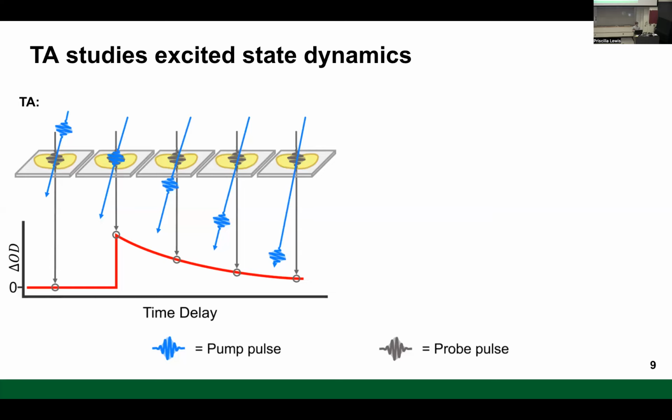Now at the second time point, we see the pump and the probe overlap one another. This means we are probing the excited state population right as the pump is exciting it. So of course, we get the largest excited state population. We call this time point time 0. Now, as the time delay between the pump pulse and the probe pulse increases, we observe this transient decay in the excited state population. Traditional transient absorption spectroscopy is really great for a variety of reasons. But unfortunately, achieving good signal to noise is a process that takes around 1 hour. And that is not feasible within the scale of our ligand-mediated transport synthesis, which is 3 hours long.